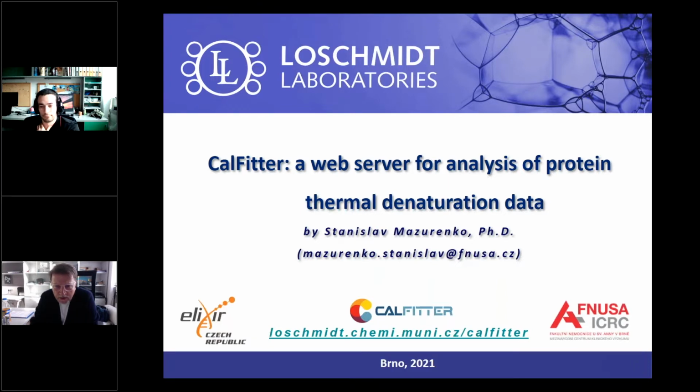Today, we have the opportunity to hear something about CalFitter, which is a web server for analysis of protein thermal denaturation data, created by Stan Mazurenko from the Faculty of FNUSA, which is, I think, the hospital of Saint Anne in Brno. So Stan, the floor is yours, and please give us the lecture.